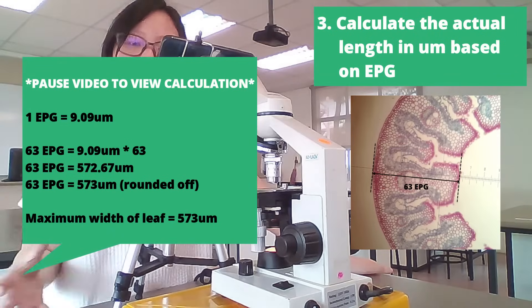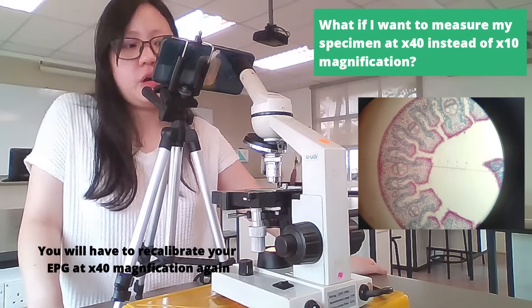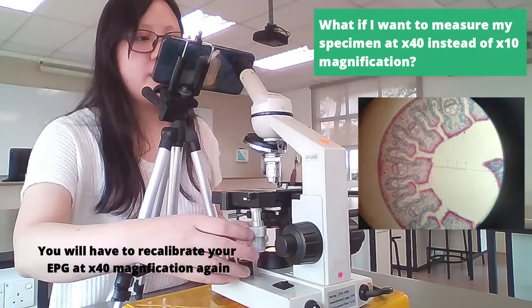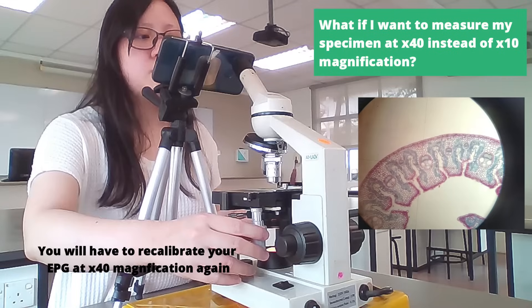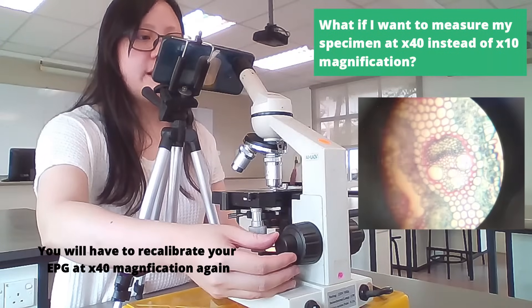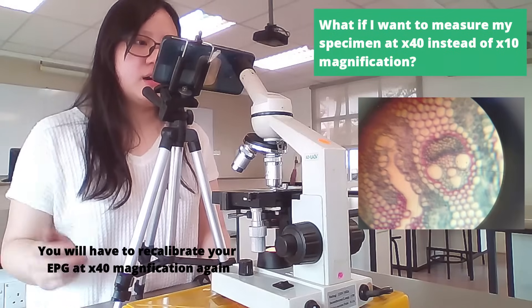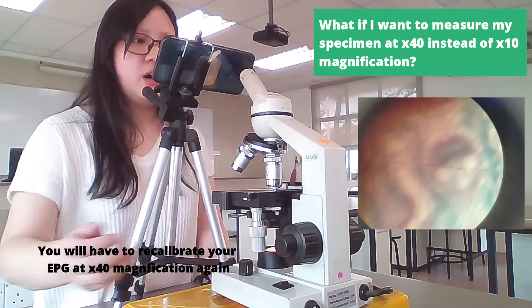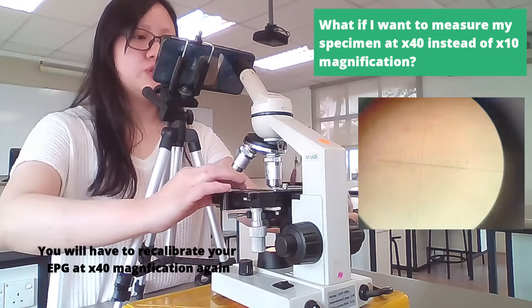Maybe I want to change the magnification of the microscope. For example, I want to measure the diameter of a certain cell and it's way too small to see, so I want to change it to 40 times. As we change the magnification to 40 times, we will realize that the eyepiece graticule doesn't change in size but the specimen has, and therefore we need to recalibrate our eyepiece graticule if we want to use 40 times.